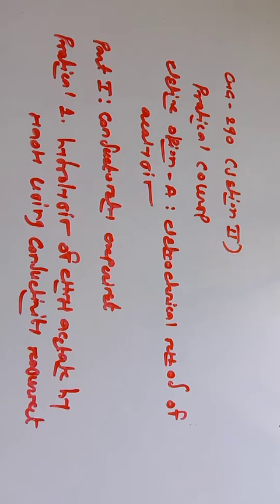The acid catalyzed ester hydrolysis is a first order reaction, but the base catalyzed hydrolysis of ethyl acetate with the help of NaOH is a second order reaction. With the help of conductometry, by measuring the conductance of the solution, we can easily find out the rate constant for this second order reaction.